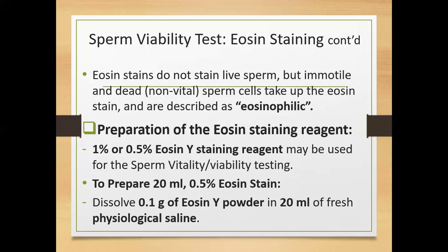It's just as the other day we talked about 10% potassium hydroxide. In the labs, some people do skin scraping, and that will require the use of 20% potassium hydroxide. If you have 20% potassium hydroxide in your lab and you need some 10%, you don't have to prepare another 10% potassium hydroxide. Just take part of your 20% and dilute it down.